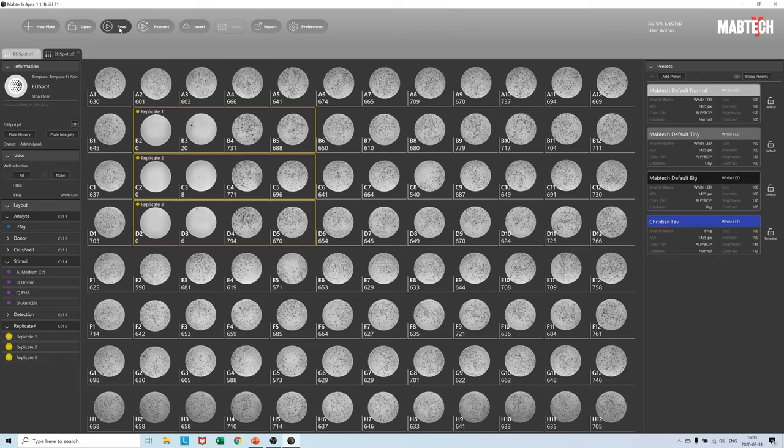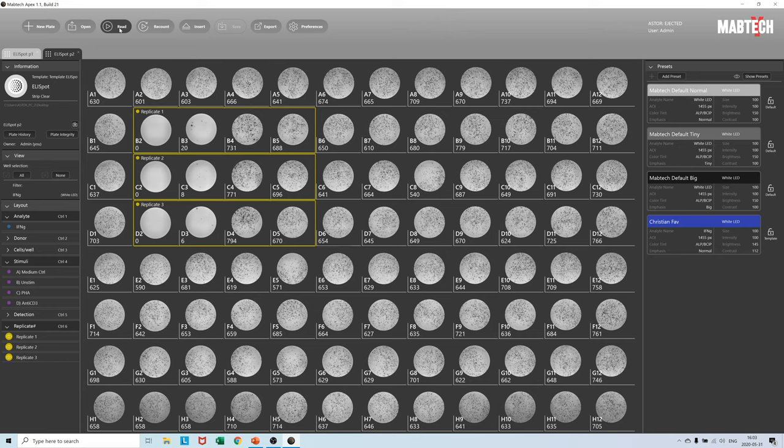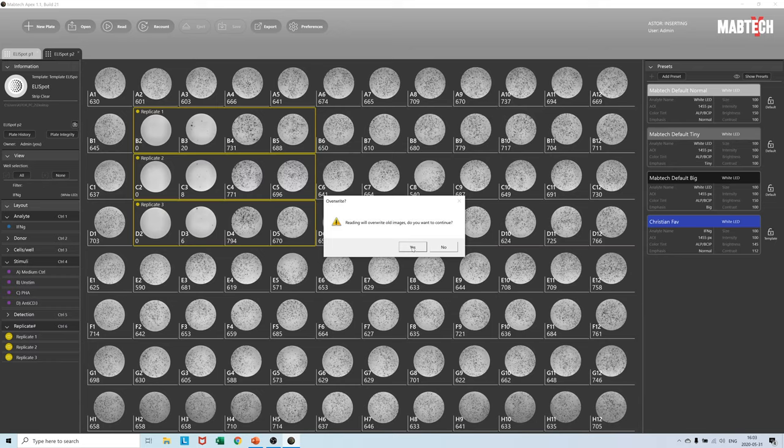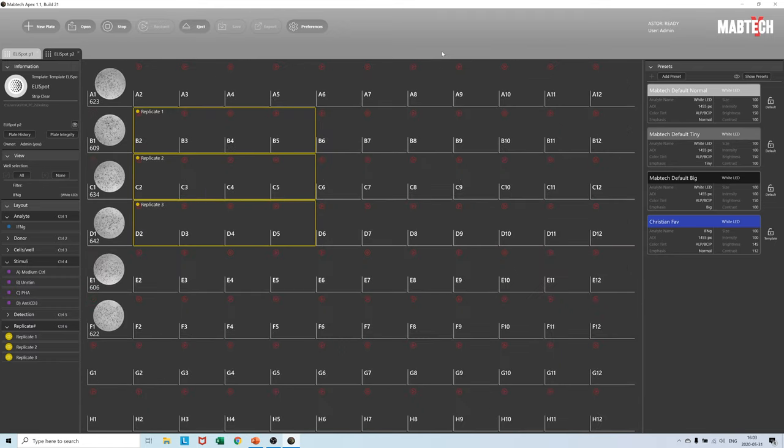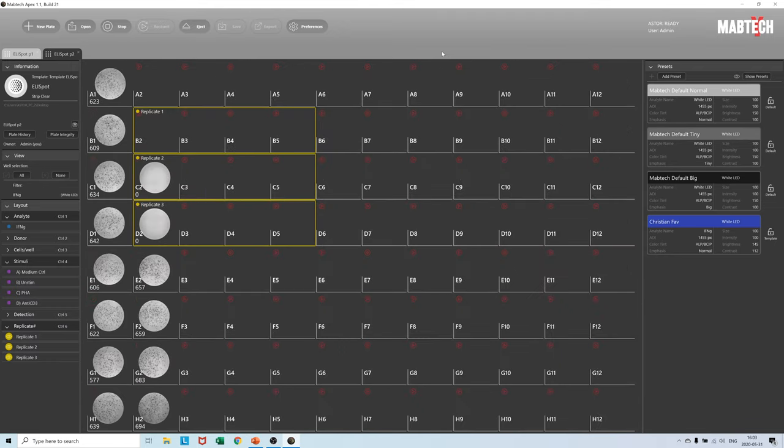Start by making sure the plate you are going to read over is saved on the hard drive. Insert the new plate and press read. A popup warns us that the data will be overwritten but since it is already saved on the hard drive all is good.